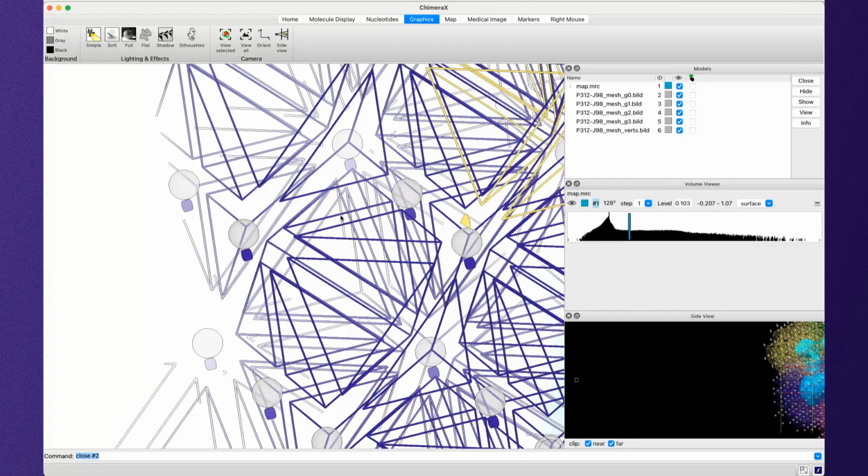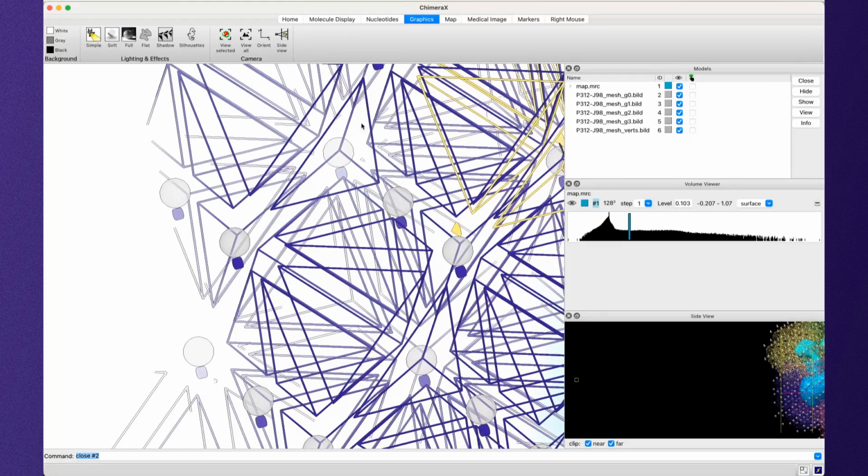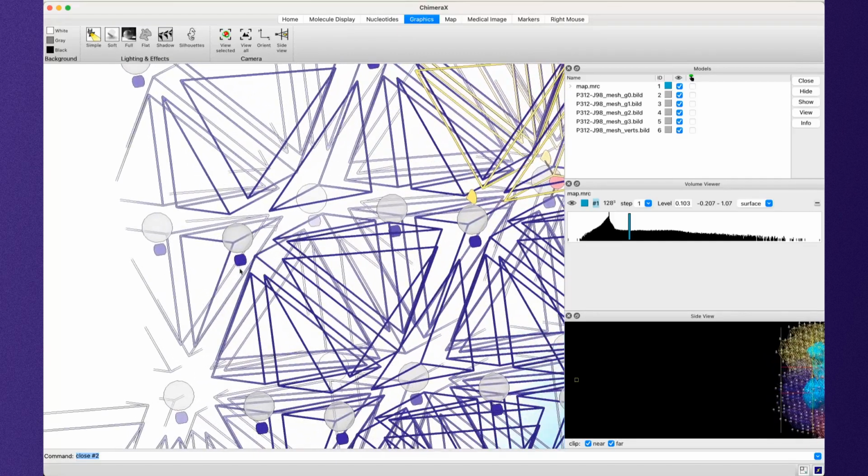That's the really important thing: whenever we move one of these vertices, we are typically moving many tetrahedral cells. We're typically deforming many tetrahedral cells. We're not just deforming one tetracell at a time because they all share these vertices. Okay, so that's what these spheres and these tetrahedra are. I've also added a colored annotation to tell us which mesh each vertex is a part of.